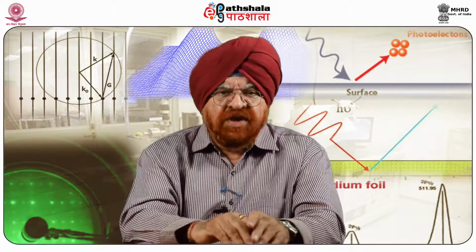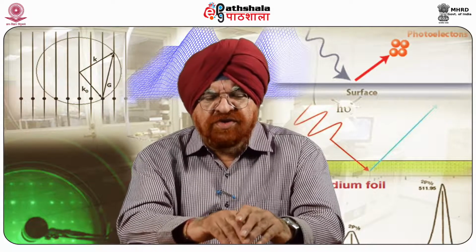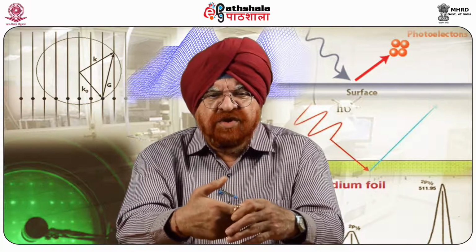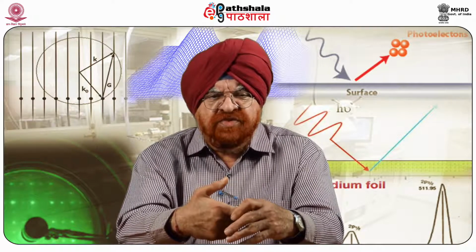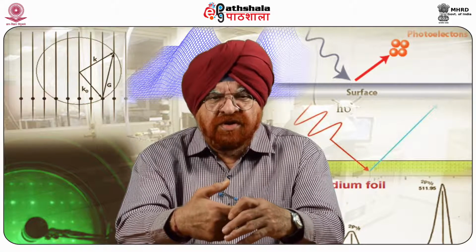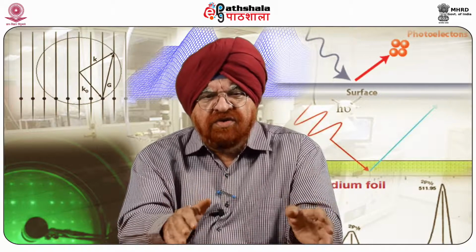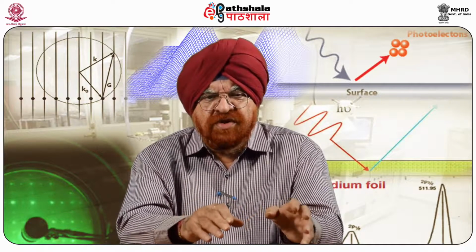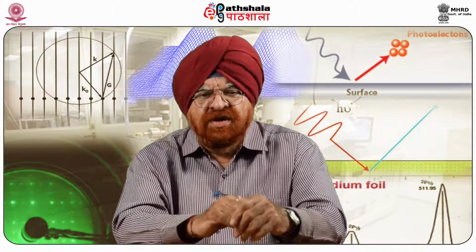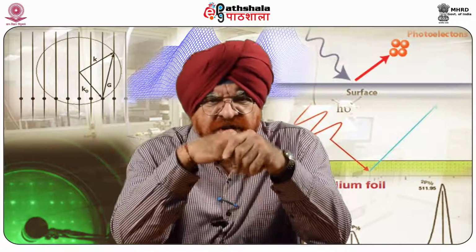Also, to confirm that the MFM signal is mainly of magnetic nature, as confirmed by Porthun et al. in 1998, the measurements were carried out at a fixed tip to sample, that is substrate plus film, distance d in the 100 to 2500 nanometer range.